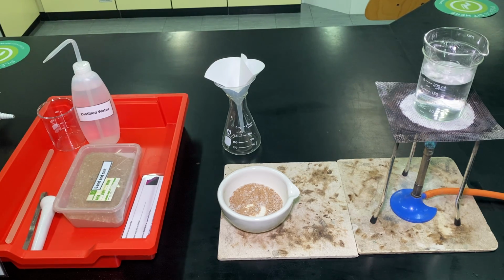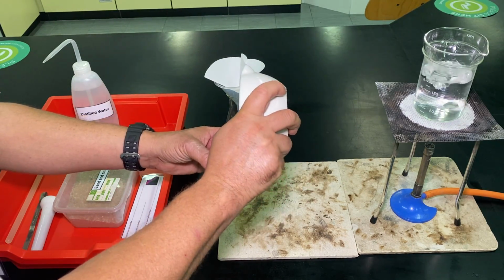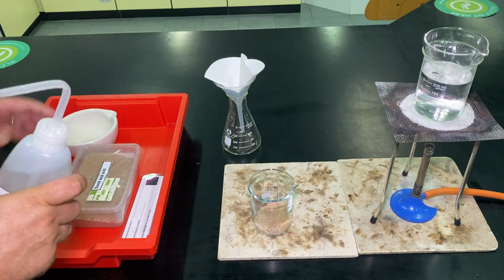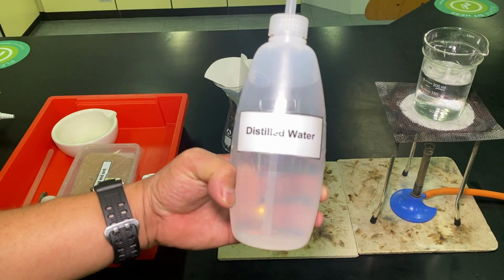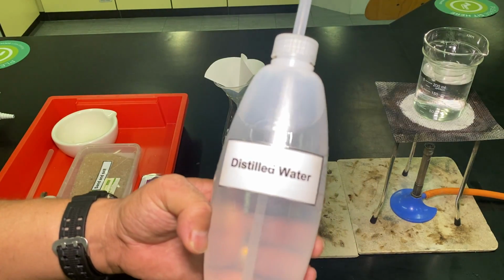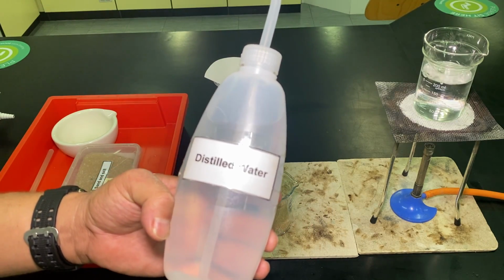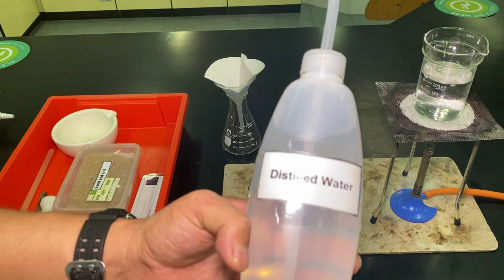Right, I'll just turn that off for now. A sample of rock salt can go in there like that. Now we're going to add distilled water. Distilled water just means pure water, because we don't want regular water. Regular water from the tap, or even bottled drinking water, contains other minerals, which we don't want because we want a pure sample of sodium chloride.